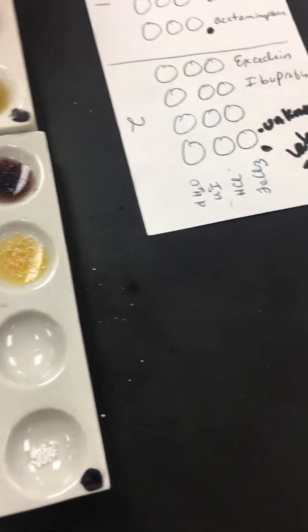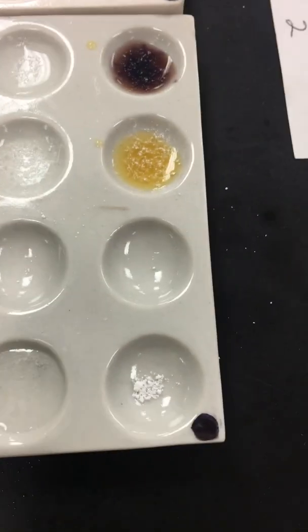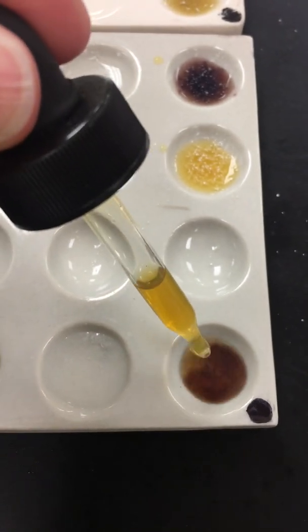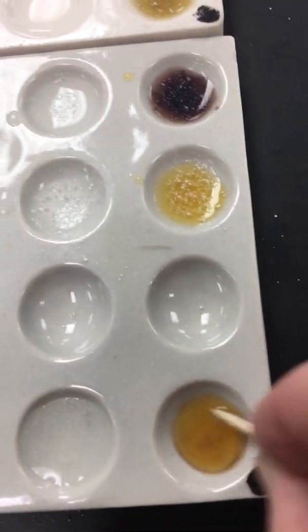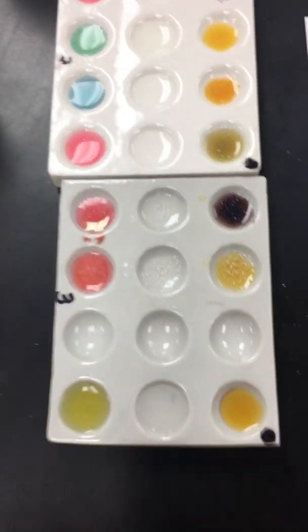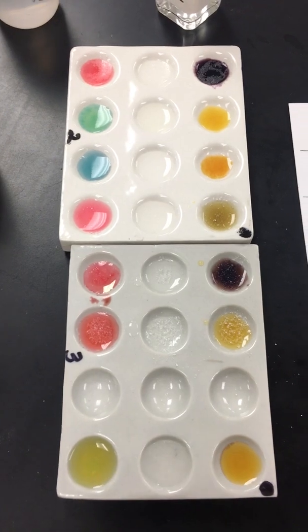All right, then we're going to do the hydrochloric acid test. And it bubbled up right away. And then we're going to do the iron chloride test. All right, so there's your unknown. And use that to write your lab report.